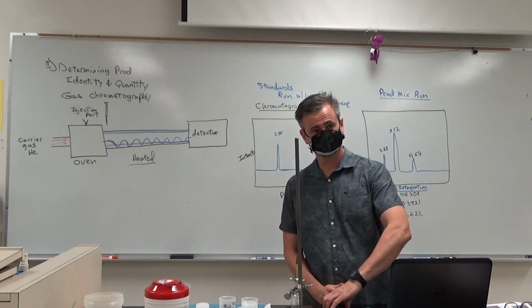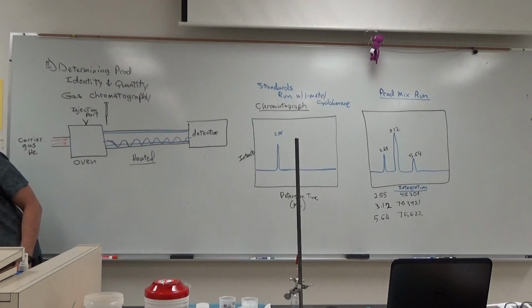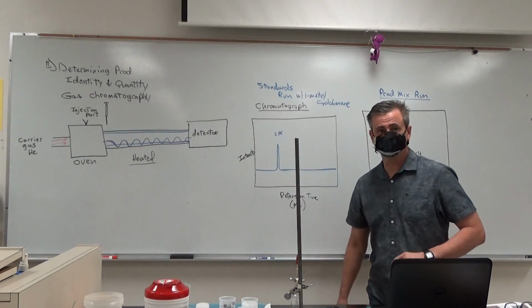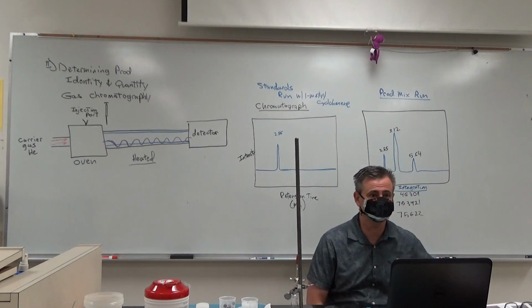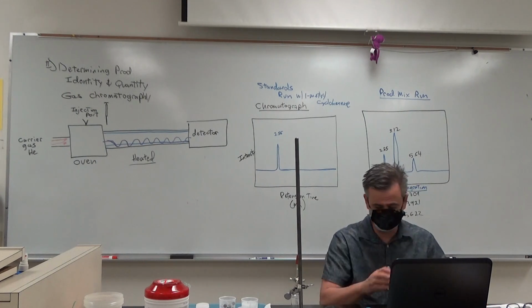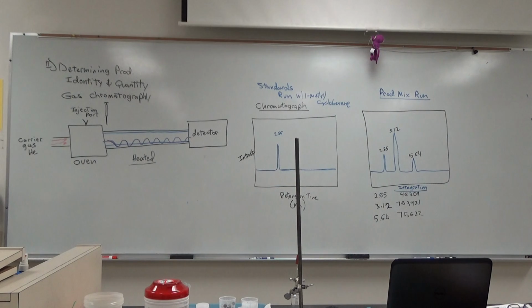So do we make the apparatus in the hood when we're adding the chloroform and everything? You make the apparatus any place, but as soon as you're involving chloroform, don't take chloroform onto your desks. Area. Does that make sense? I forgot to check that, so. Okay, that's it, guys. Any questions? Sorry. Are these the handouts for today? Yes. Okay.